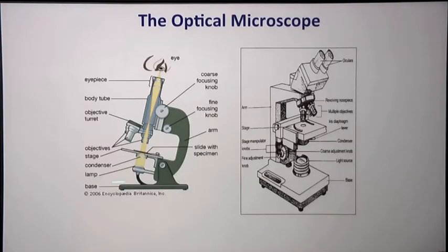Somehow you have some source of light, or photons, if we want to be fancy about it. And those photons have to get to the sample and somehow interact with it, and then we use a lens to make an image of that interaction. And that image, which ends up somewhere over here, we somehow have to detect. And with most light microscopes, it goes into an eye, or even more commonly a camera nowadays. And an electron microscope is really nothing different.